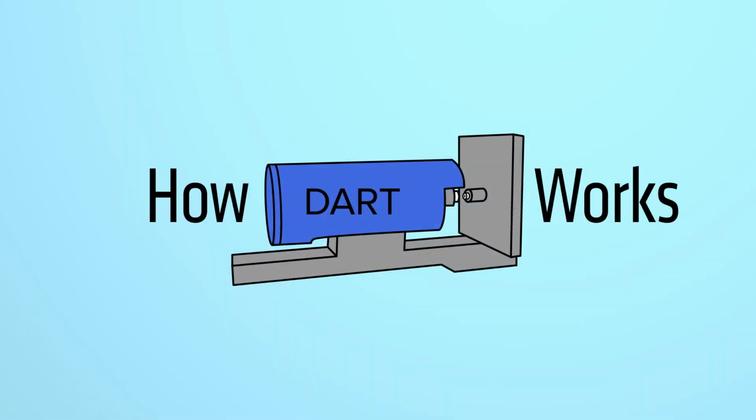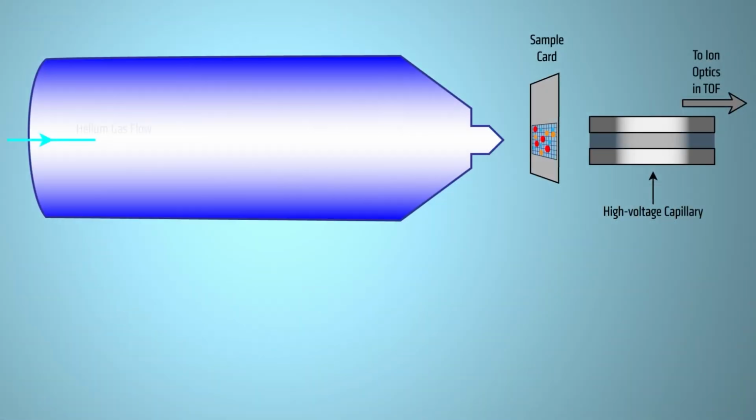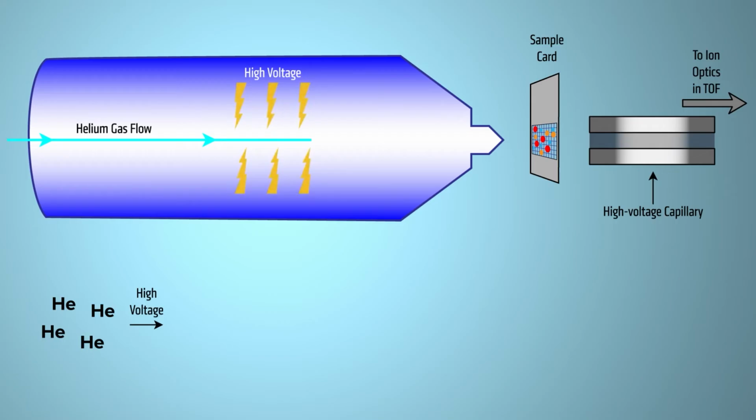Direct analysis in real time is another soft ionization technique that uses a heated stream of helium plasma to ionize solid, liquid, or gas samples with virtually no sample prep. First, an electric potential is applied to helium gas to generate helium plasma that contains short-lived energetic species, ions, and importantly, long-lived excited state helium atoms that are metastable.